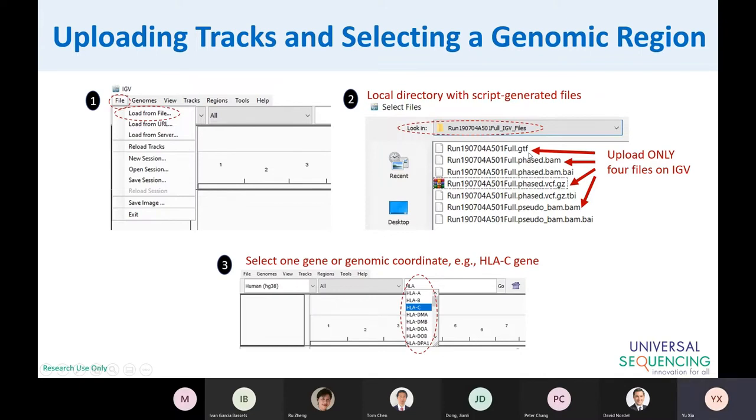And in this track there are multiple view options IGV allows. There's a very informative view option. People may want to have all the reads belonging to haplotype 1 grouped together, aligned to the reference genome, and the same for haplotype 2, and also the unphased reads.